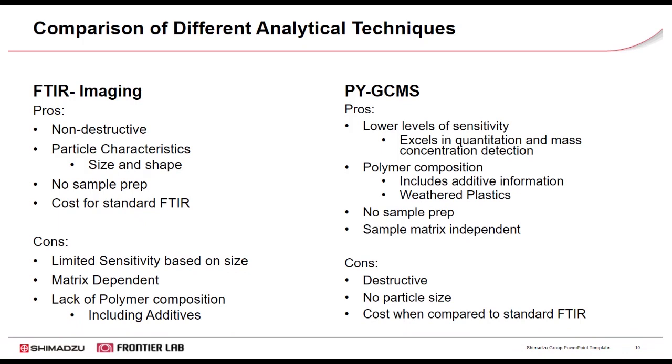While PYGCMS cannot exactly determine particle size and shape, it is not limited in the size or amount of particles that need to be collected for analysis. With this advantage, PYGCMS, or Pyrolysis-GC, can stretch the LOD lower than before and remove any bias on accurate concentration at lower levels. If you return for part 2, we will dive into this a little bit more.